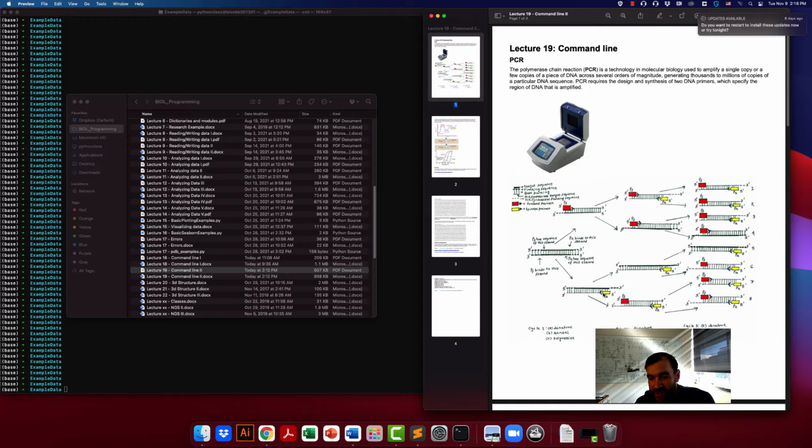And the same thing is true with that reversed primer. So this is a primer that is complementary to the top strand, and so it forms a double helix, and then the polymerase is able to extend from the 3' side in order to make a copy of this. So let's say you just start from a single copy of the region that you want to amplify from, and then you add your primers, and then now you have 2 copies of that region.